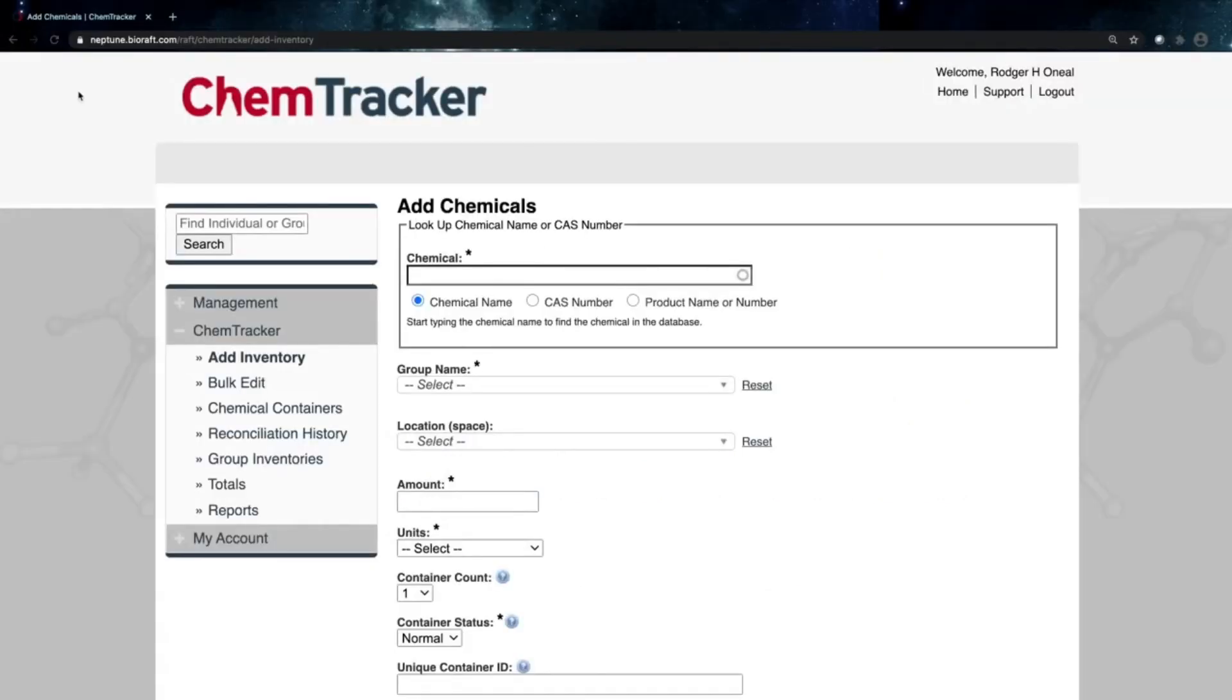Hello! We're going to be going over today how you can enter a chemical into ChemTracker with a barcode or RFID tag.